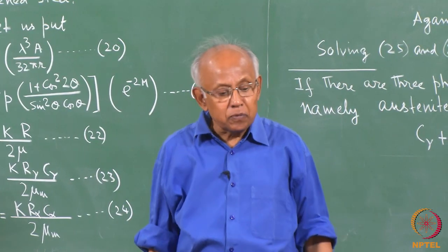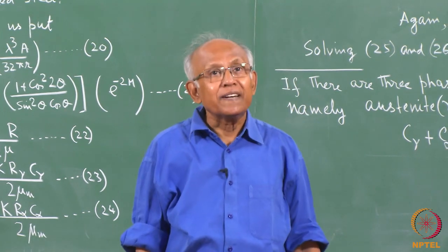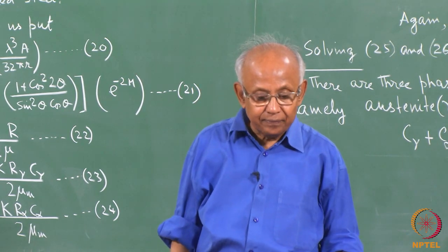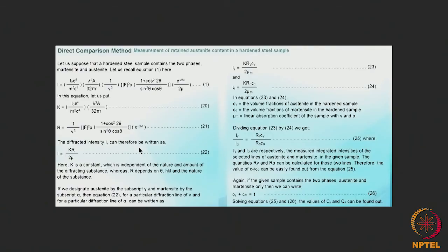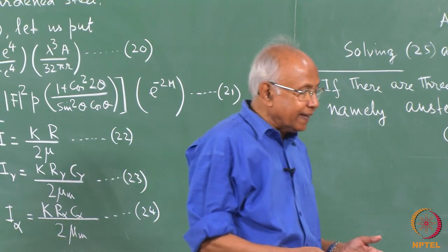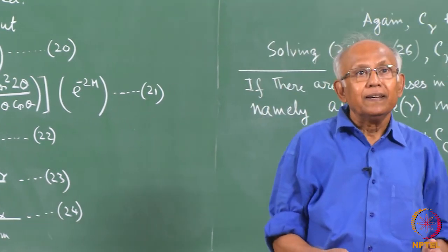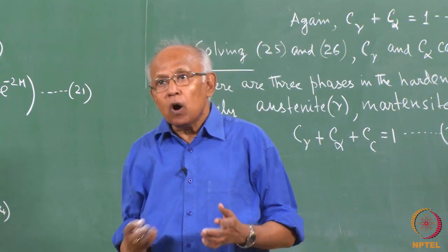Now, I come to the third method of quantitative phase analysis using X-ray diffraction. This is known as the direct comparison method. You see, in the first two methods, there are certain problems. For example, in the single line method, it is essential to have a pure material.